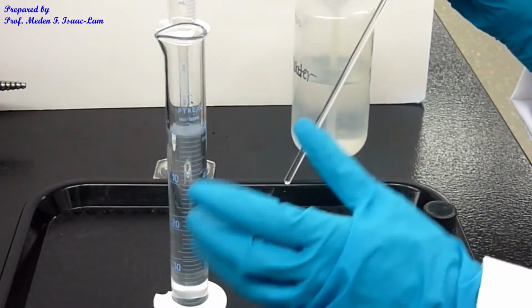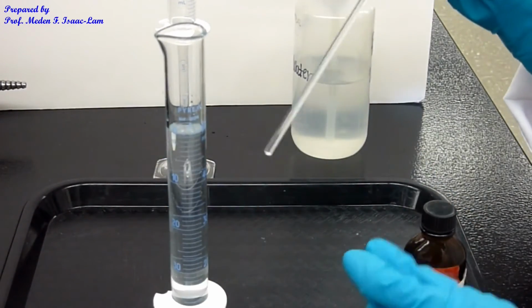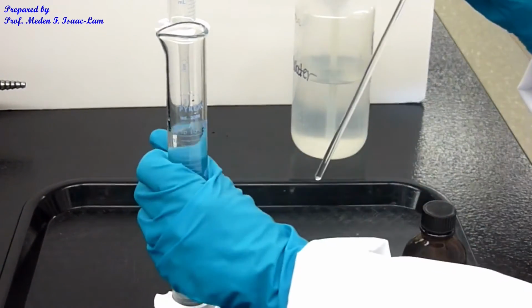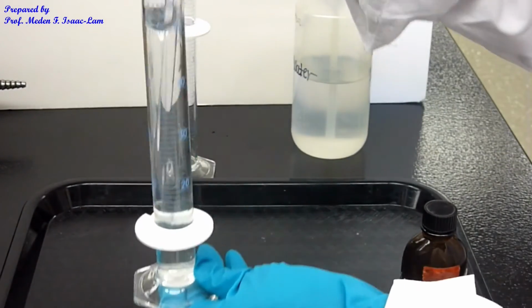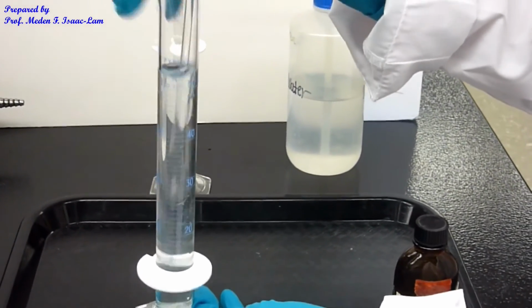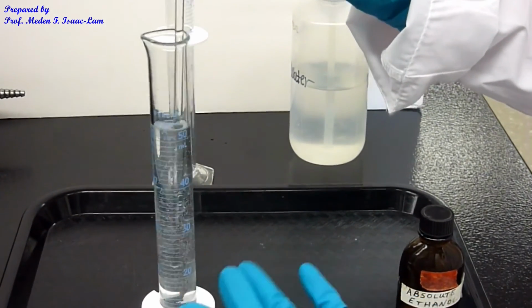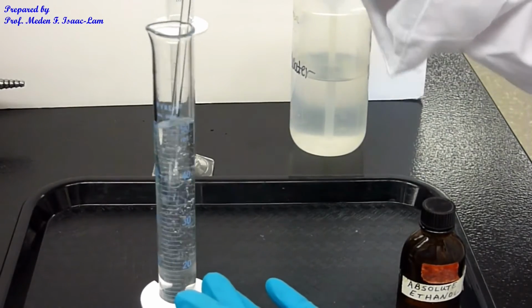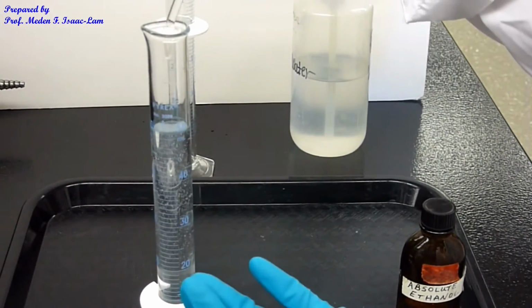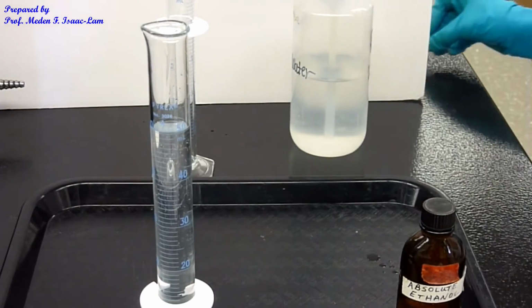When you mix it, it's a little bit warm because there's a heat of solution that is formed when you're mixing two solvents together, and you see that it's again a solution. I can mix it, and you don't see any layer. It's not like your salad dressing kind of mixture of oil and vinegar that you see when you're putting it in your salad.